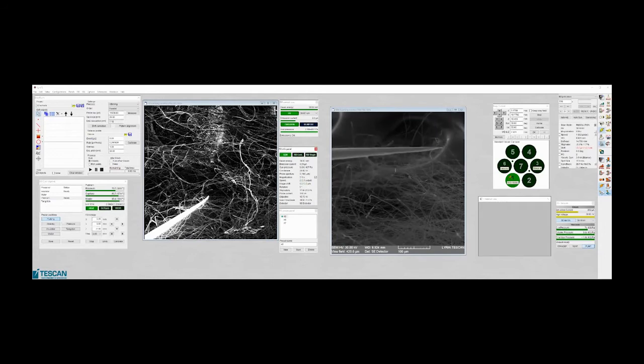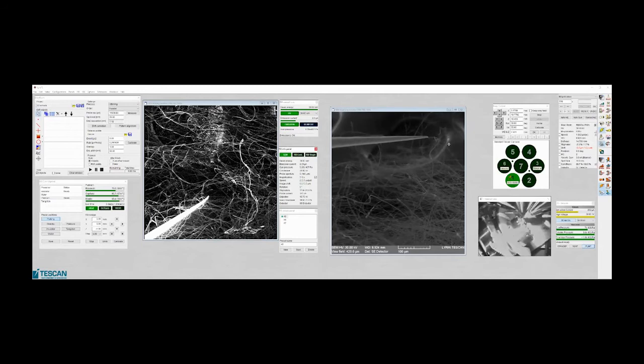So if you are lucky, you will touch only one of it and you can fix it by gas injection system. So you can fix it by SEM material. You can fix it there. Okay, I'm just playing there and back. I'm not very patient here. So sorry for that, that I'm not able to pick up only one, but okay, I'm only playing with it.